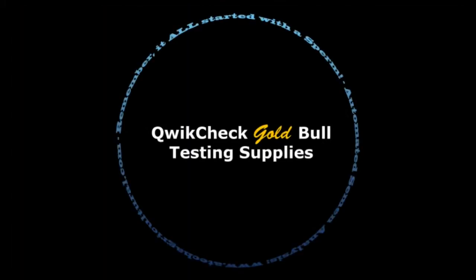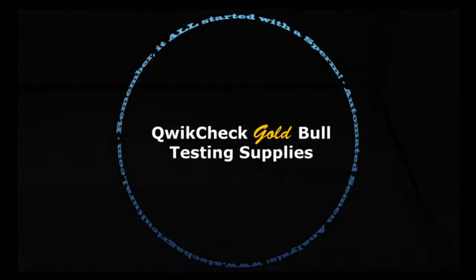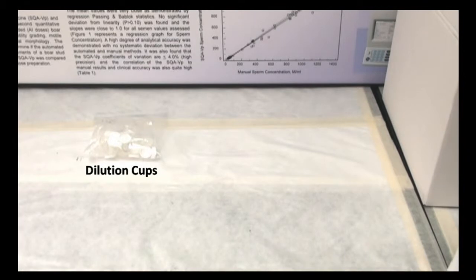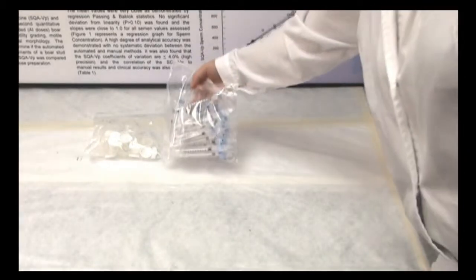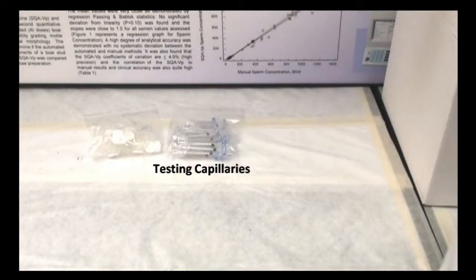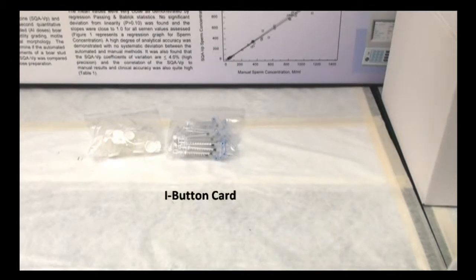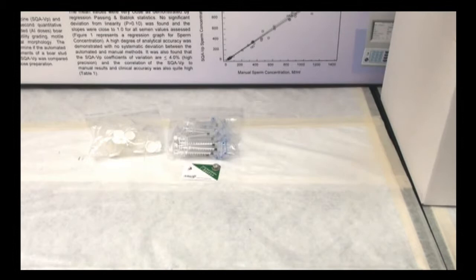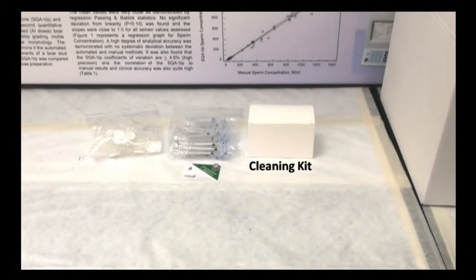Now, let's take a look at the supplies necessary to run the QwikCheck Gold. Dilution cups are used to preheat the diluent and mix the sample for testing. Testing capillaries are for running the sample, an I-button card to load your tests into the system, and a cleaning kit for daily cleaning.